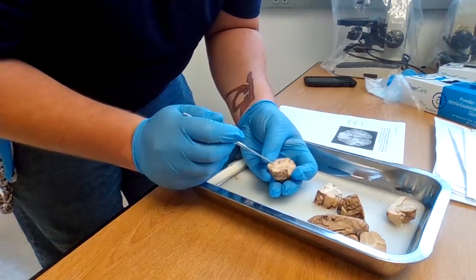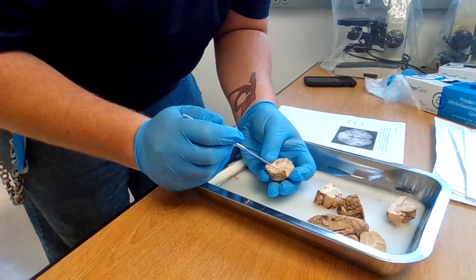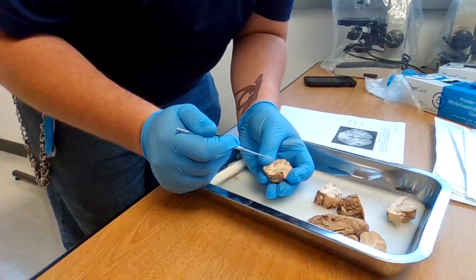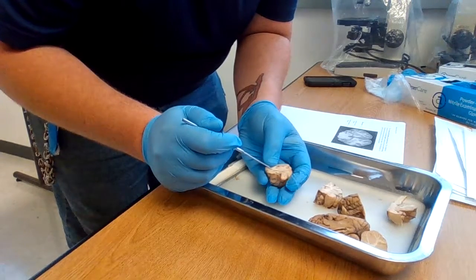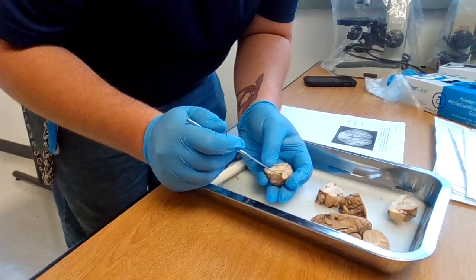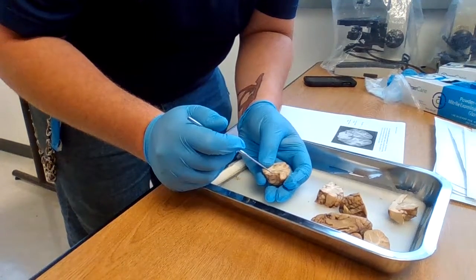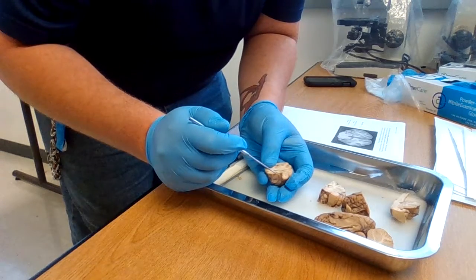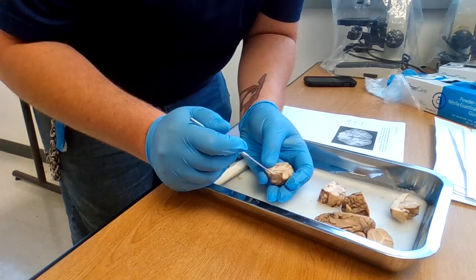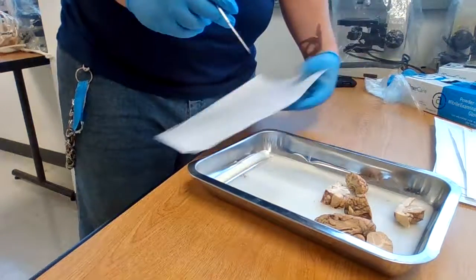We have the hippocampus, lateral, the lateral nucleus, the medial nucleus. And that is how to dissect the brain.